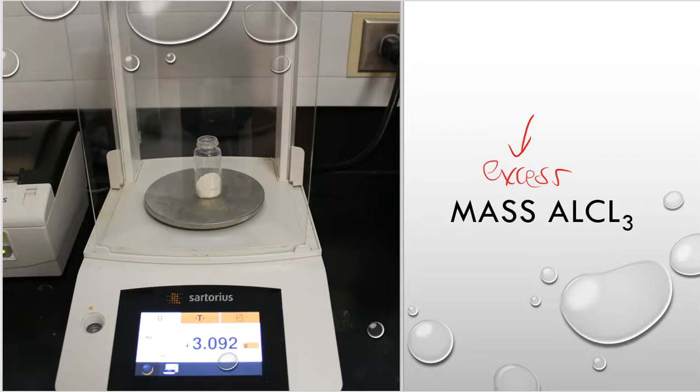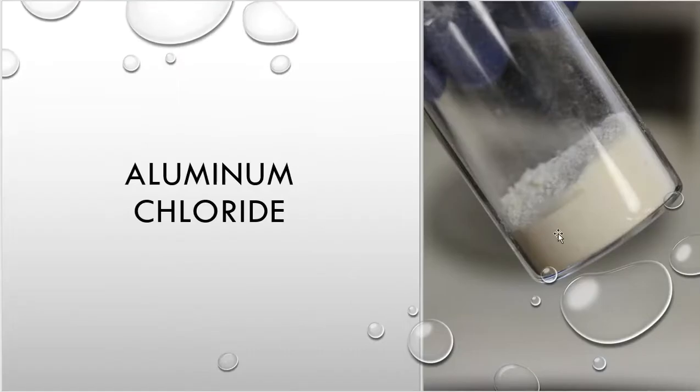And if any of this is deactivated in some form or fashion, maybe due to water that's lingering behind, then the extra is actually there for that purpose. So we know that nothing's going to be perfect in the real world. And if we calculated how much we actually needed for real, it would be way less than this. But we're going above and beyond here. All right. So here's the close-up of the aluminum chloride. This is what that AlCl3 looks like. So it's just a white, grainy-looking powder. Again, nothing fancy, nothing that's going to make it stand apart from the crowd.